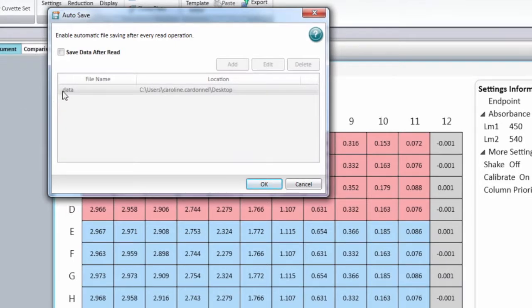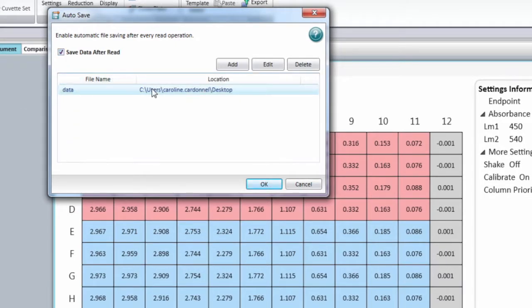In the autosave window, select save data after read, click on the current autosave, and then edit.